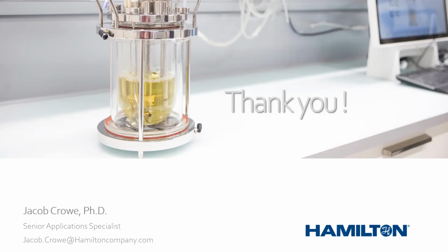Thank you for that question. The answer to that one is I've seen offline, so typically what I'll find is offline based measurements being discrete in nature. You typically will only update a control parameter n number of times, where n is the number of measurements you're taking and recalculating. So let's think of something like specific growth rate. If you want to do an exponential feed profile using a pump system, and you want to modify the pump speed, typically you'll find the discrete nature: you'll just have steps where you've manually adjusted it.